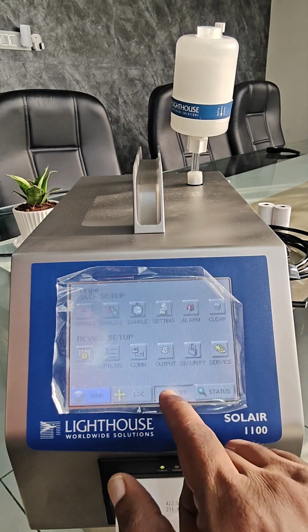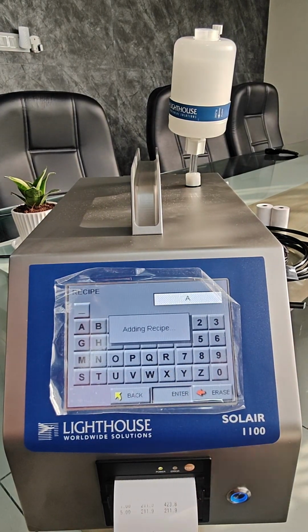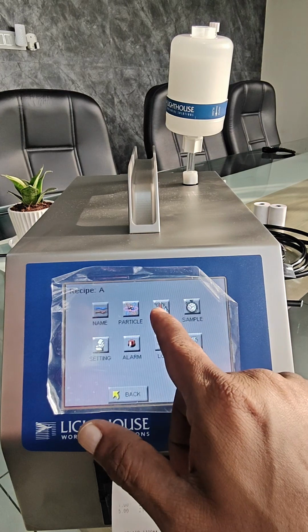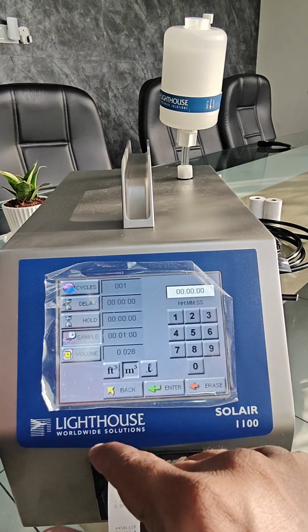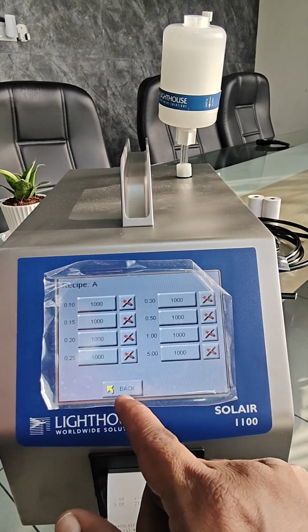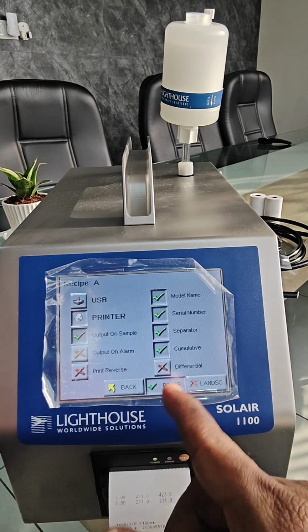Okay, also you can have a recipe. You can create, add a recipe if there is no recipe. Say for example I am just adding one recipe with the name grade A. Here you can have particle size whatever you want. This is not applicable because we don't have analog sensors. Here you can change according to your grade A standards or whatever. These are the settings for alarm location. If you want to link these things, and if you want a printout also, you can have a printout.